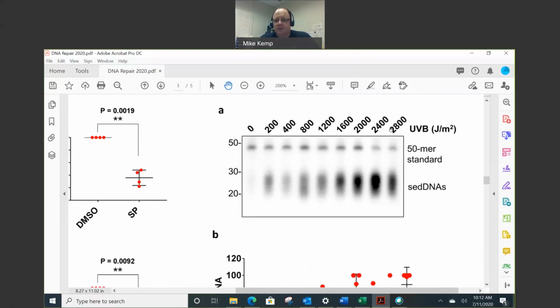And then we go to increasing amounts. And as you would expect, it's largely dose dependent. There is some variability. Part of this is the processing of these samples. There are a number of steps, as we showed in the first figure, that could potentially lead to loss of material from one sample to the next. They may lead to some of this variability.